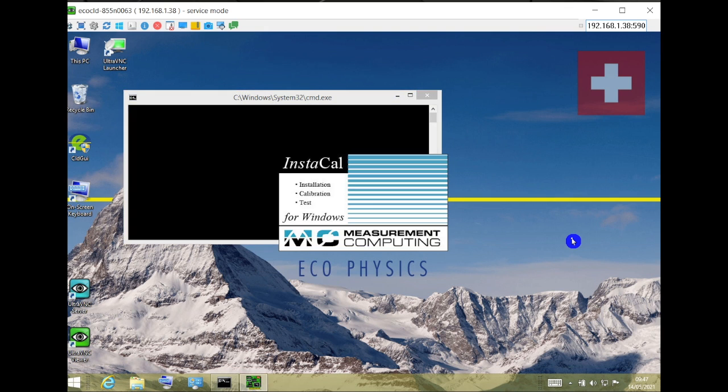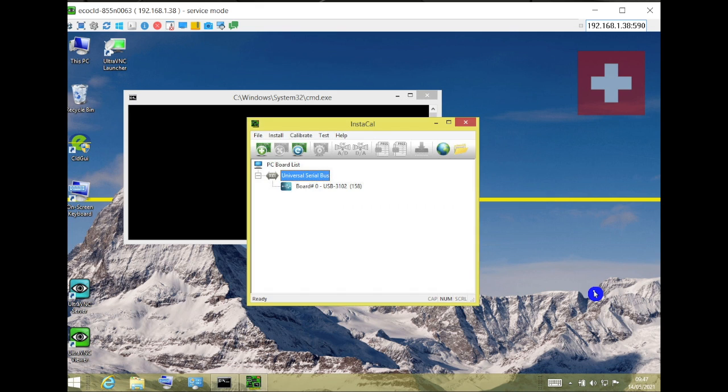The NCLD goes into Windows mode again and shows you that the USB 3102 box is now installed on the analyzer. As soon as you close this window the analyzer launches GUI and goes back to normal operations.